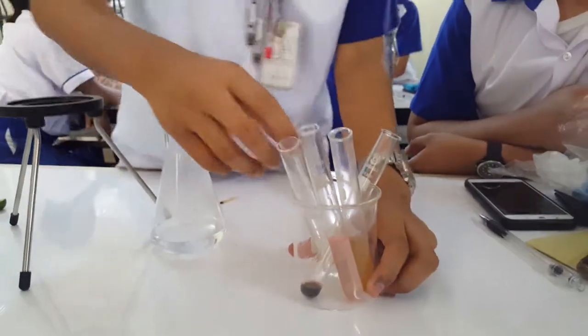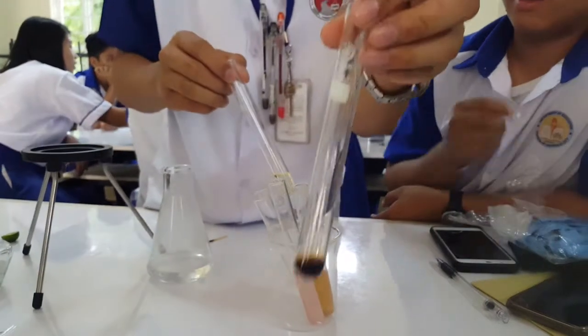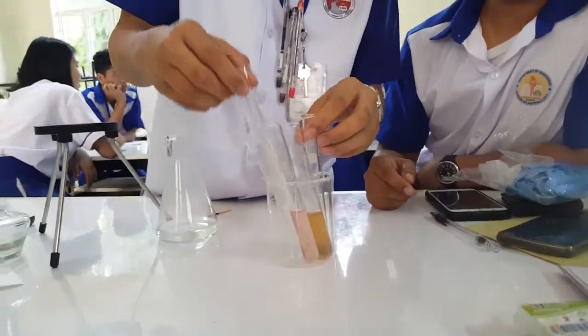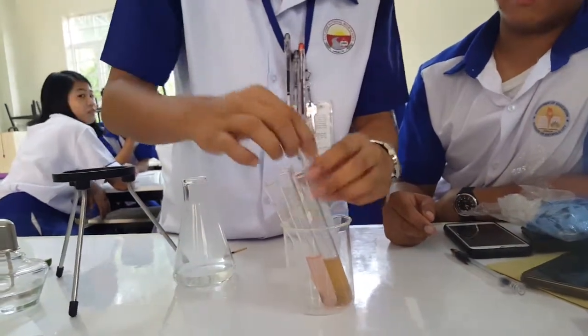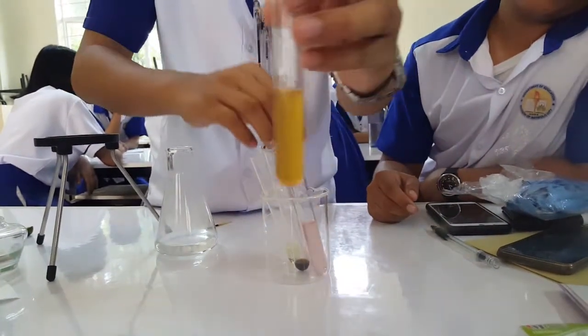Here are the following substances that we are going to use in our experiment. Oil, soy sauce, vinegar, watermelon juice, and soup broth.